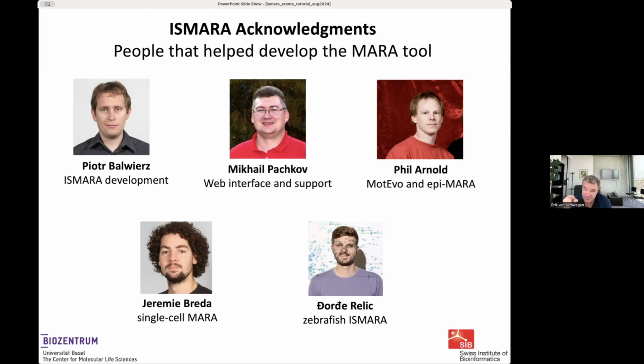By the way, the Drosophila, so maybe I can turn this question around. If anybody has a nicely curated collection of regulatory motifs for the Drosophila transcription factors, and they're interested in getting ISMARA for Drosophila, they should contact us, because really the main hurdle of this thing is to curate a good collection of non-redundant regulatory motifs.